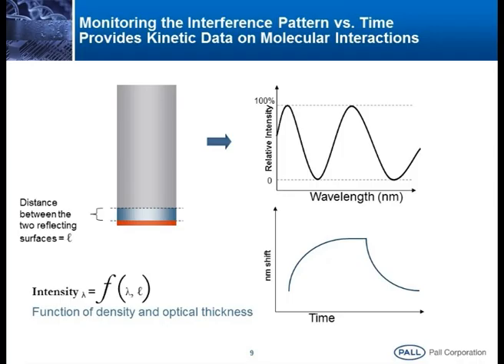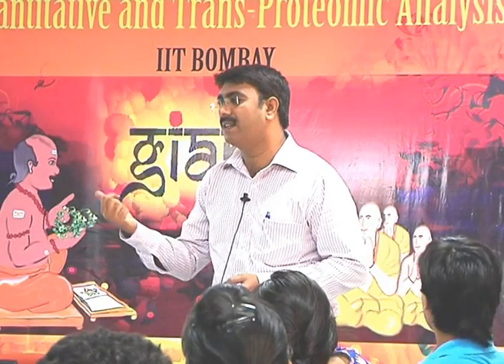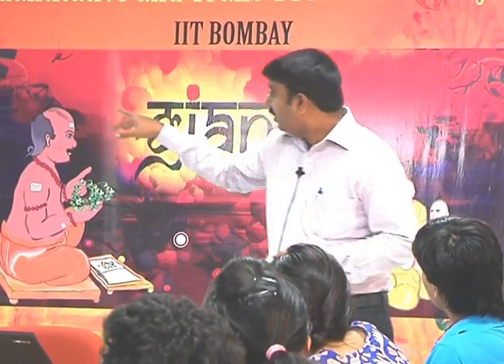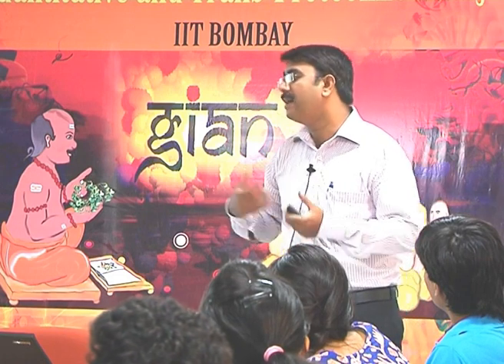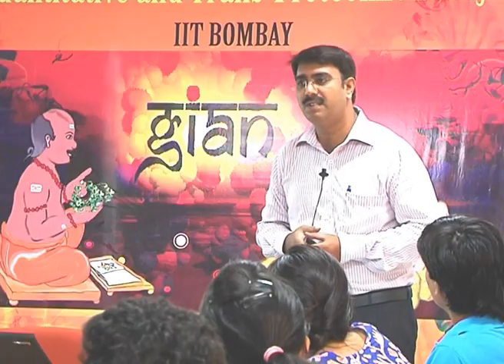Suppose in the case of drug discovery, you require a small amount of a drug to elicit a response. Just a picogram or nanogram level of material, that much concentration is required to elicit a response, or the efficacy of the drug, I mean to say. So such kinds of things come into the picture here. Less concentration, more response, longer time in the body. That is what we call a strong affinity towards the receptor.